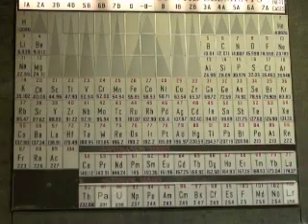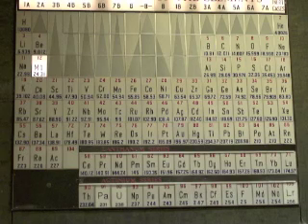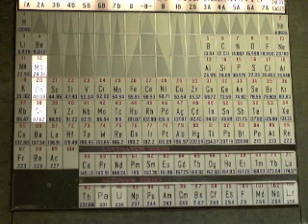We saw that magnesium did not react with water, but calcium did. As we go down the group of alkaline earth metals, what happens to the relative rate of reactivity of the metals with water? What do you predict will happen if strontium or barium is added to water?